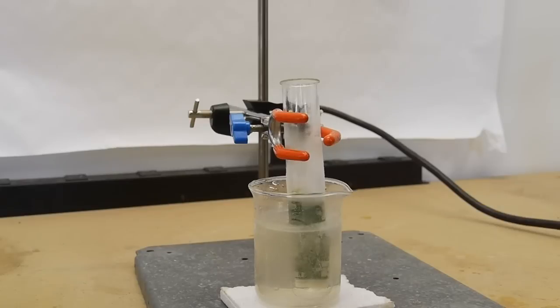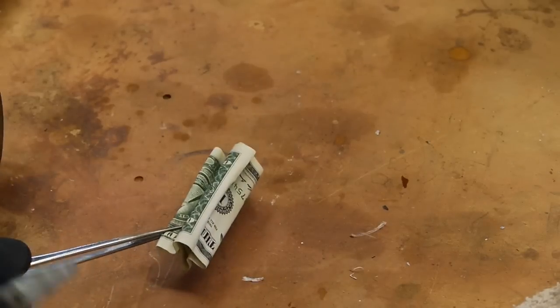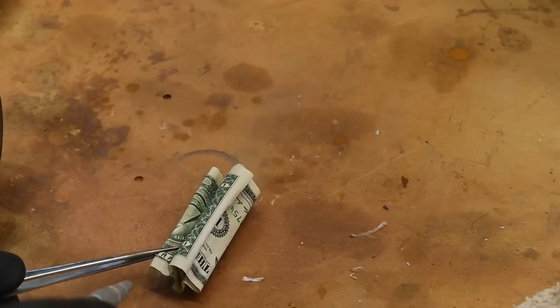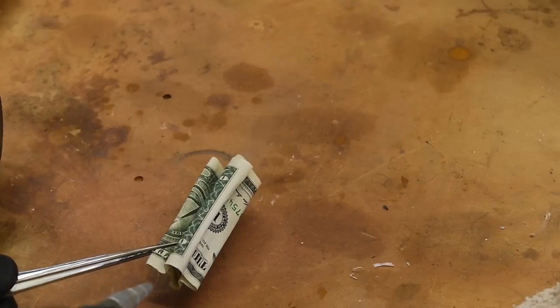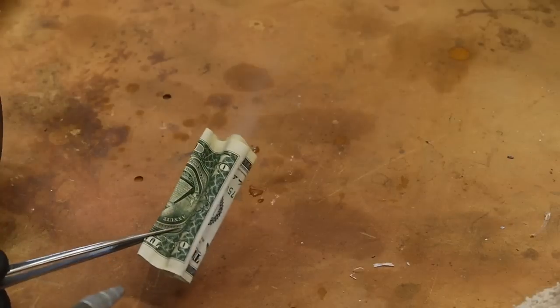Then I rolled up the dollar and put it into the test tube, and repeatedly took it out and dried it. As you can see, when the bill is drying it's actually shrinking a little bit, and through each cycle it shrinks a little bit more, until it sort of runs out of ability to shrink further.